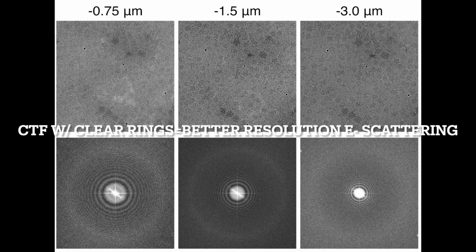And that's just something you've got to toy with in order to get good data, because the closer you are to the focal point, the better the image you get, but the farther away you get, the easier it is to actually spot the stuff that you want to look at. So yeah, that was all of just the intro to cryo-EM, and now we can actually get into data processing.